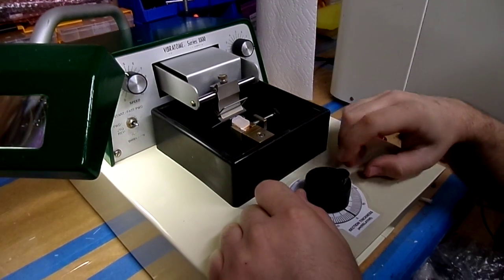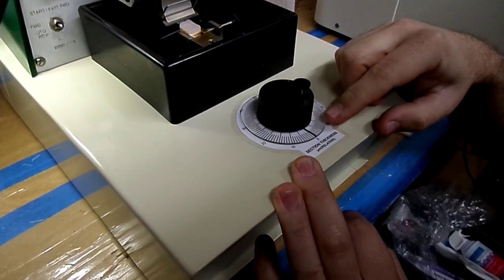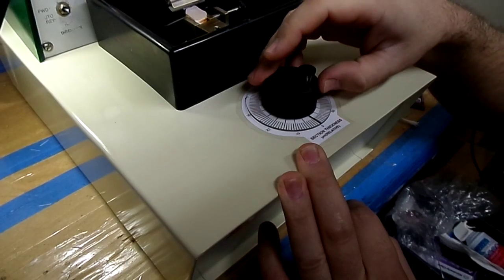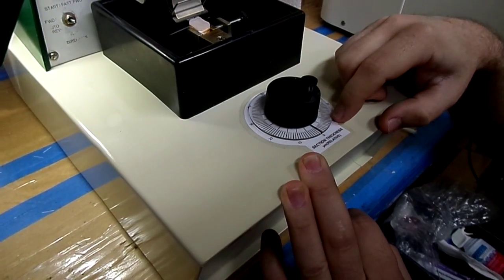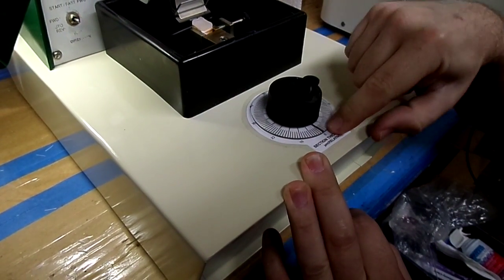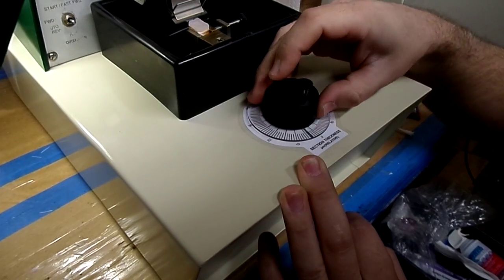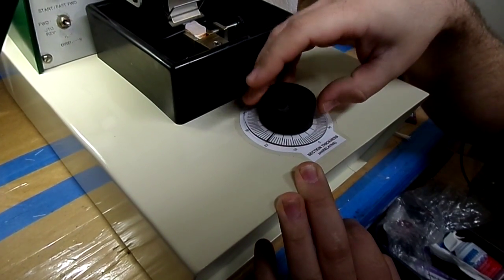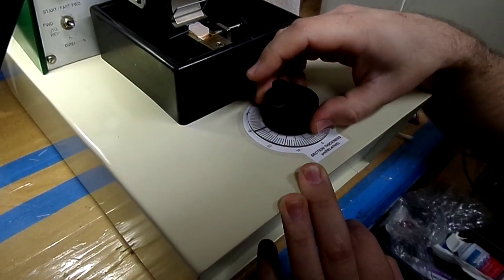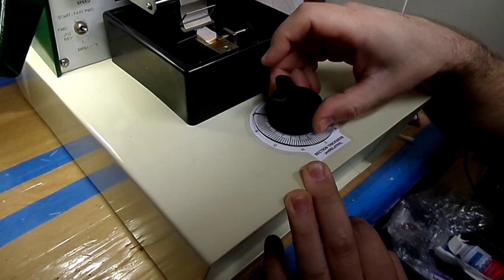So the way that we adjust the specimen thickness is with the dial here. It's relative, so if you've cut at zero, if you go to 10, it's going to do 10, 20 is 20. But if you start at 20, then 30 will do 10, and 40 will do 20. So it's relative to wherever you did your last cut.